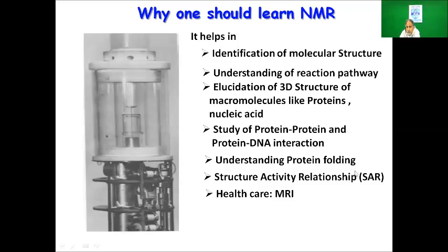So friends, I am sure that you have understood the role of the nucleus. I am sure you have also understood the role of the magnet and how these two come together for resonance, and why the subject is called NMR, or nuclear magnetic resonance.